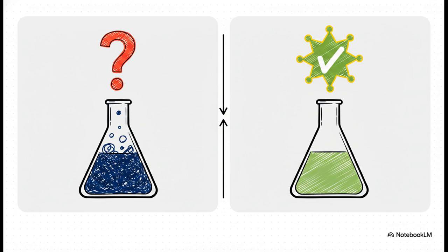To interrogate it and find its true concentration, we are bringing in our reliable informant, a weak but highly standardized acid known as oxalic acid. Because oxalic acid is a primary standard, it's super stable and totally reliable. We know its exact molarity, in this case 0.050 molar. We are basically going to pit them against each other.